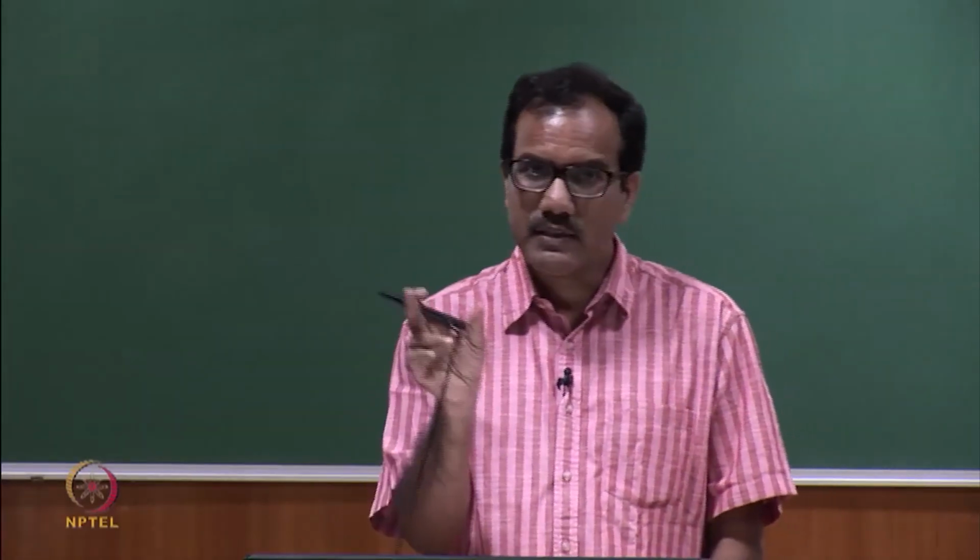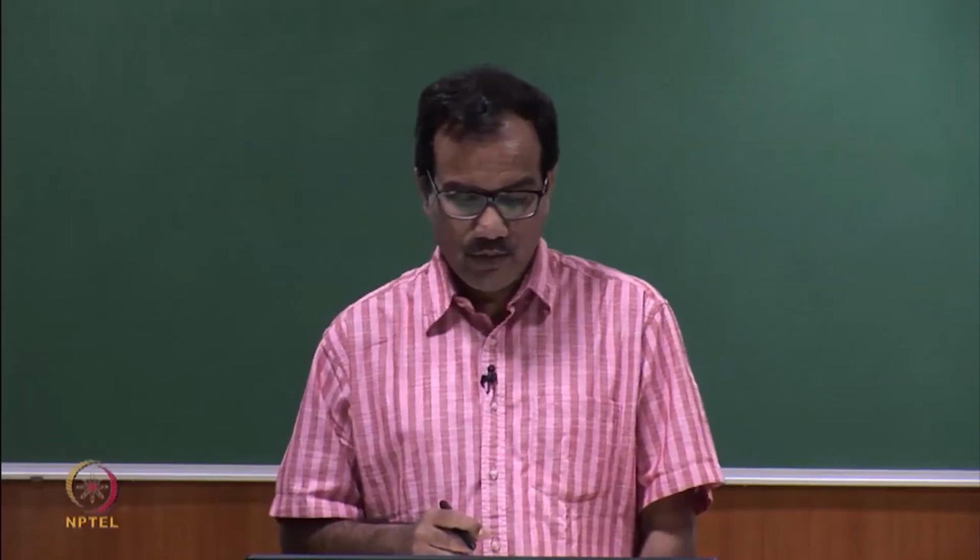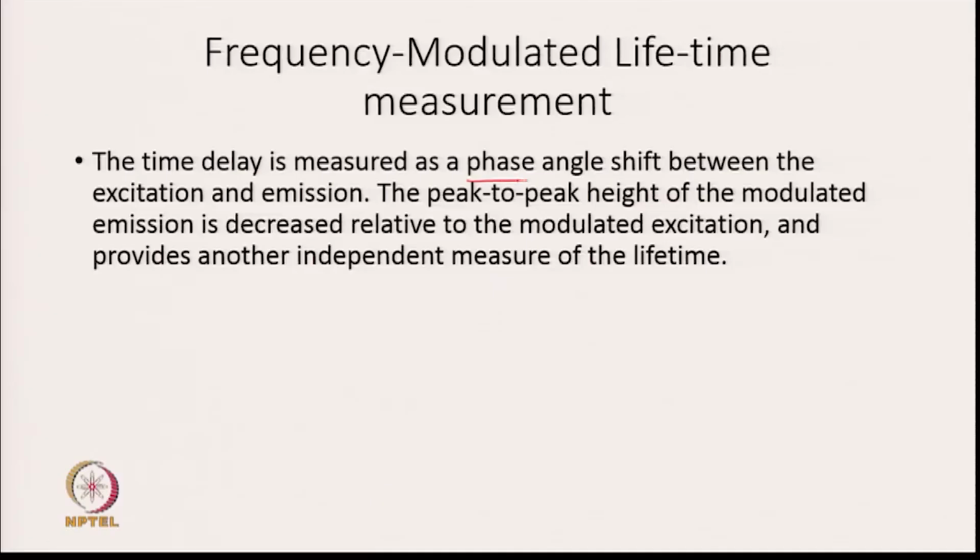Now we are measuring the difference in phase. So if I can measure the phase angle shift between excitation and emission, then I can calculate the lifetime.